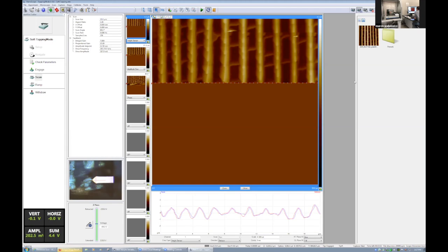But you can do other methods. There are all different types of force when it comes to AFM, which is why it's really versatile. You can even look at cells, if you pick the right probe. Think about AFM as having a little nanometer-sized finger that you can stick into things and touch them.